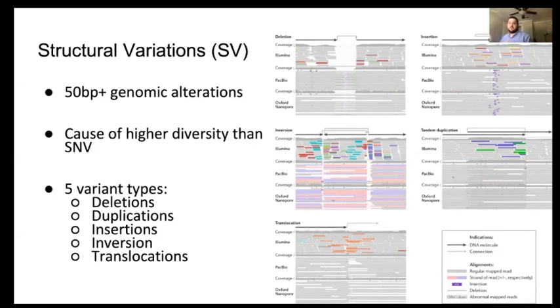Traditionally, we detect these variant types by mapping short reads or long reads, where we identify abnormally distant paired-end reads from short reads, or abnormally split reads in short reads or long reads. Split reads are where 2 or more segments of the same read are mapped to different locations.